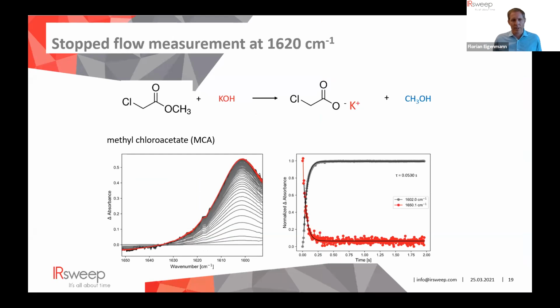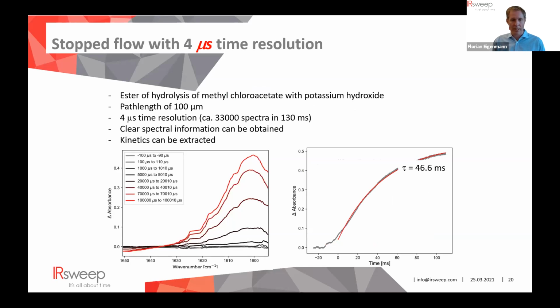The first results we received are actually also covered in a specific webinar, but I just want to highlight it. It's a kind of test reaction of methyl chloroacetate with potassium hydroxide. We increased the concentration a little bit to speed up the reaction, and we got really nice results, in the order of a few milliseconds, and we were able to determine a lifetime of 47 milliseconds.